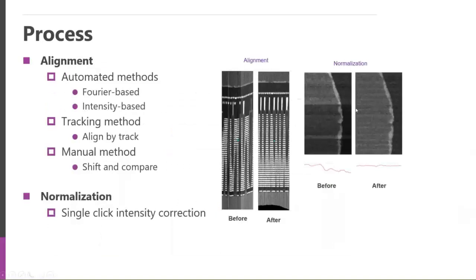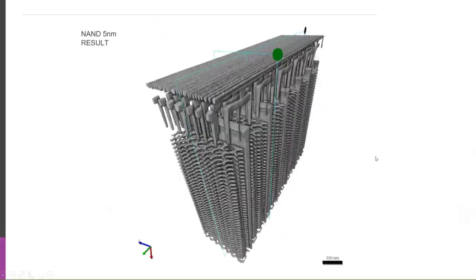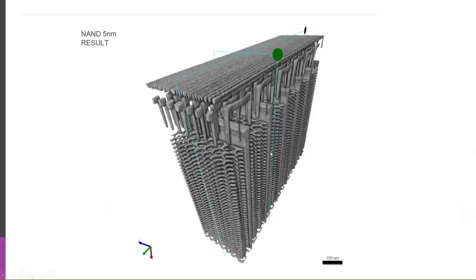This is the alignment again, but in addition to alignment, we have normalization. There can be uneven lighting or irregularities throughout the Z stack, and normalization helps to produce really nice images. Here's an example of alignment and normalization correction. You can see these images are nicely homogeneous, and they look very nice. So having a nice aligned data set and normalized data set helps for visualization and accurate measurements also.